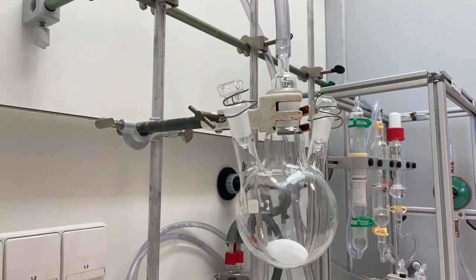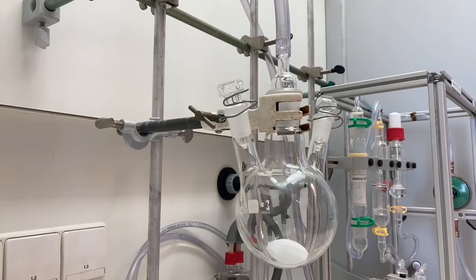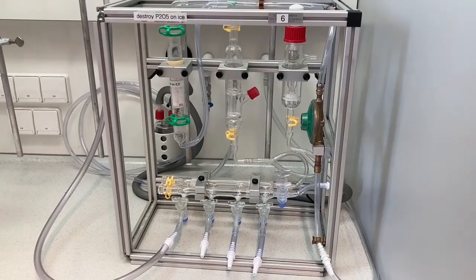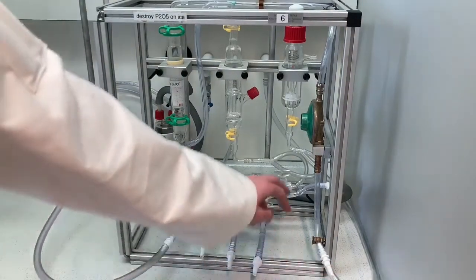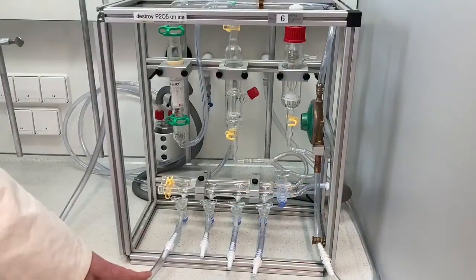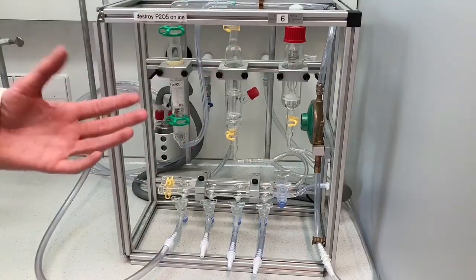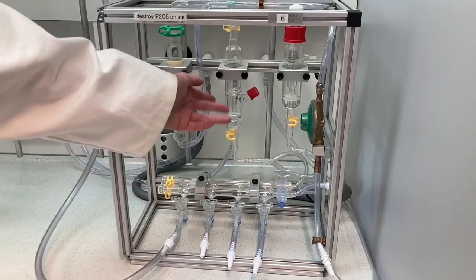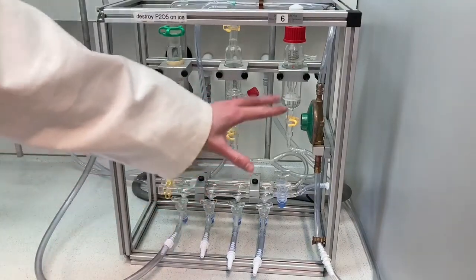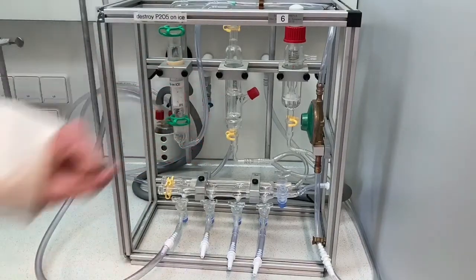Now we will show you how to cycle the nitrogen and vacuum line to make sure your reaction is properly under nitrogen. The nitrogen rack is now connected to the nitrogen from the fume hood, the vacuum from the fume hood, and to our system. First, check if the system is working — make sure there is no bubbling when everything is closed, because bubbling would indicate a leak. As you can see, there is no bubbling, so our system is airtight.